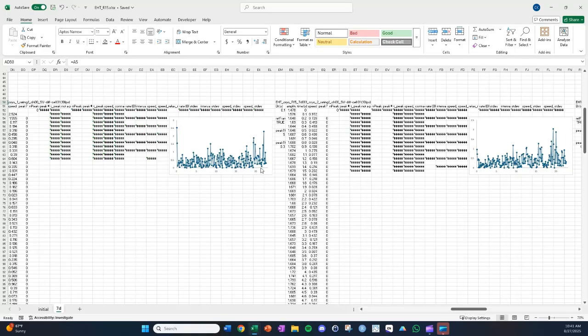Here both of these are a rating of 1. And this is all just noise. All the things here that are less than 1 arbitrary unit per second is all just noise. Maybe something here or here, it's picking up an individual cell that I found moving, because I did give it a rating of 1, so there's something moving in the field of view.